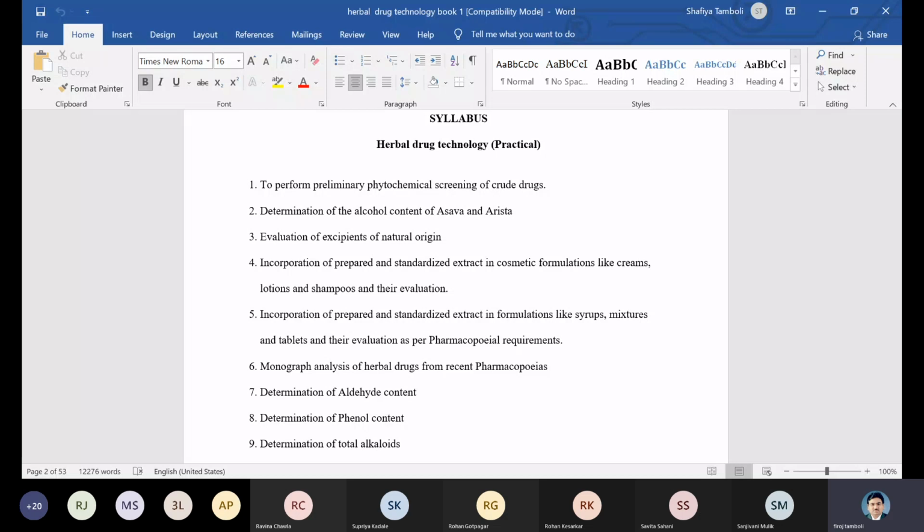And suppose it comes positive, then it indicates that whatever you isolated via the successive extraction process definitely contains a steroid moiety at the initial stage. Then you go for the separation technique. Like that, flavonoids, again for flavonoid. Here an example MCQ may be asked for your sessional, for your final, from this practical point of view. For steroids, I say pet ether is responsible for the isolation.